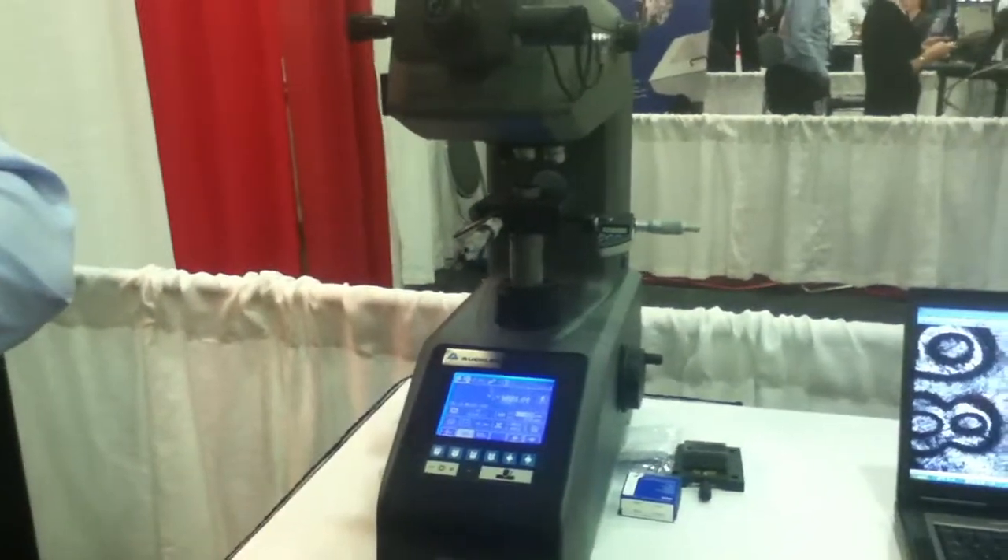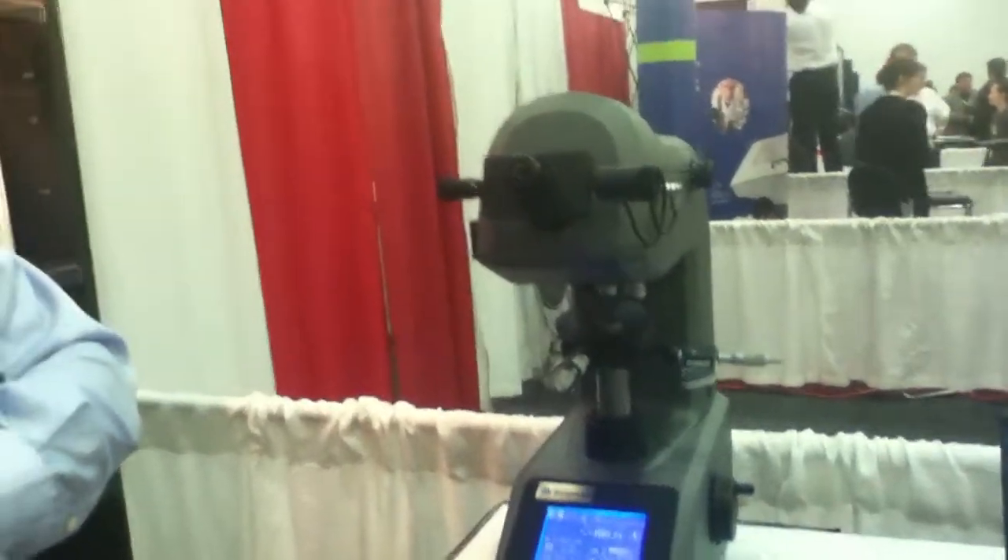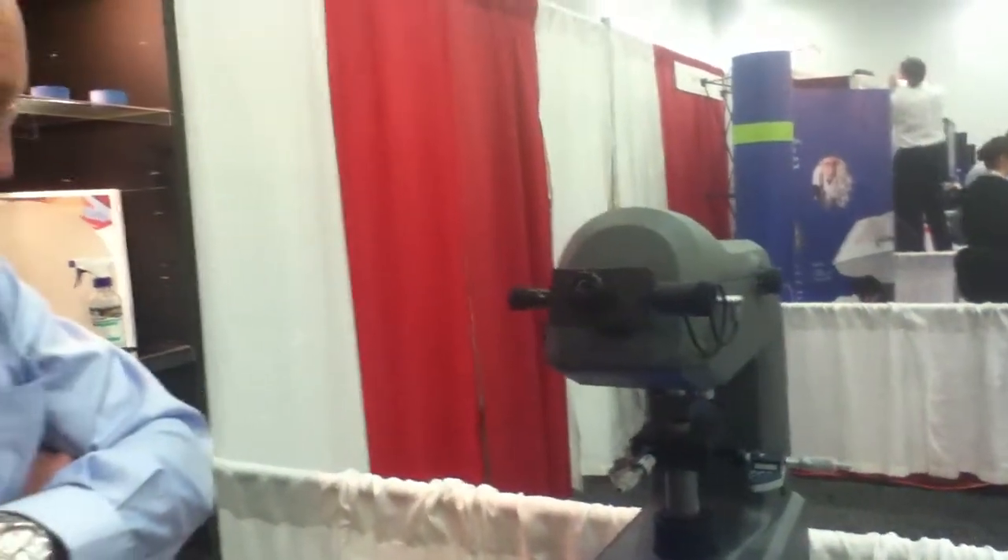We also have our software package for automation known as OmniMet MHT. The unit comes as a single indenter option or dual indenter options. It carries up to four objectives and really does define state-of-the-art in micro indentation hardness testing.